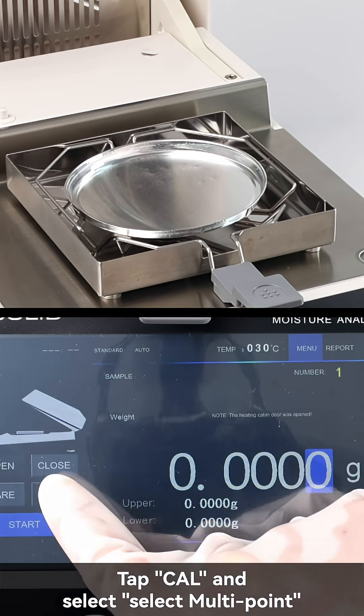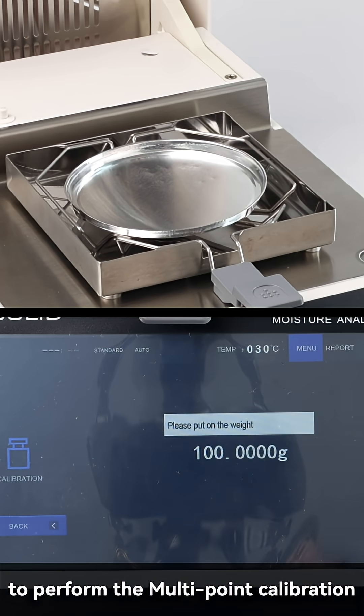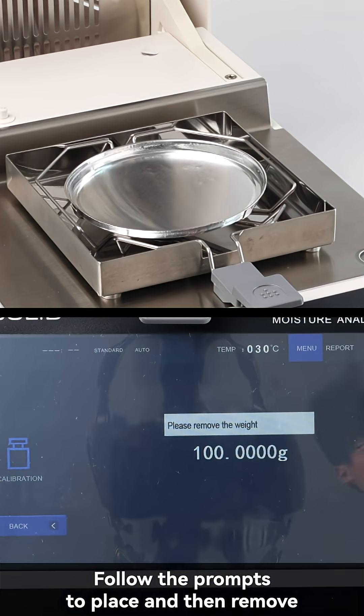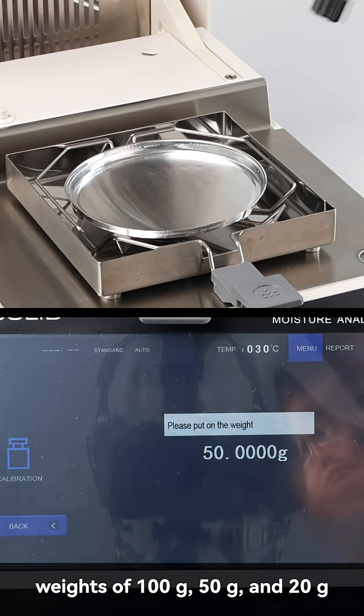Tap calibration and select multipoint to perform the multipoint calibration. Follow the prompts to place and then remove weights of 100 grams, 50 grams, and 20 grams.